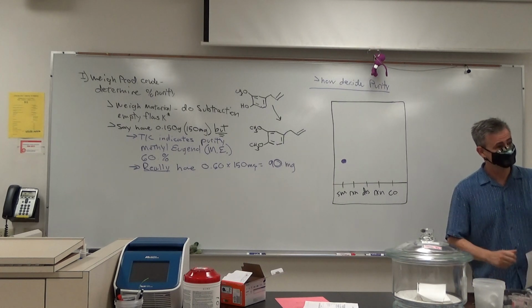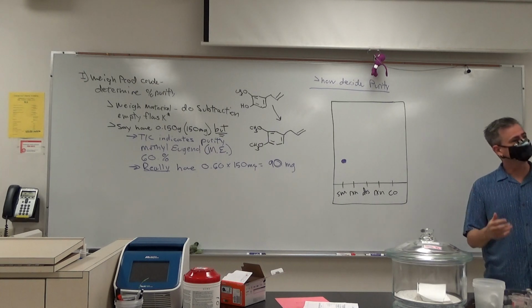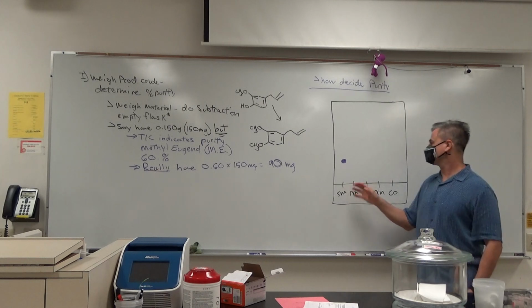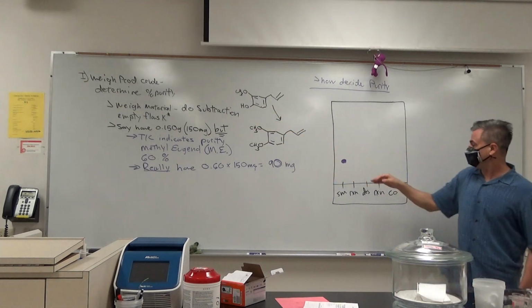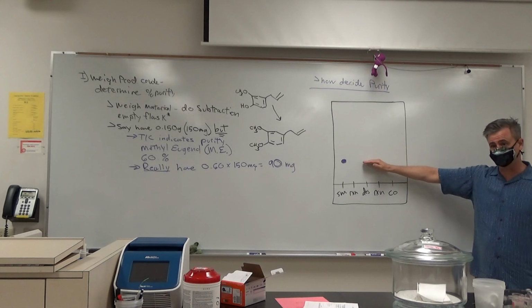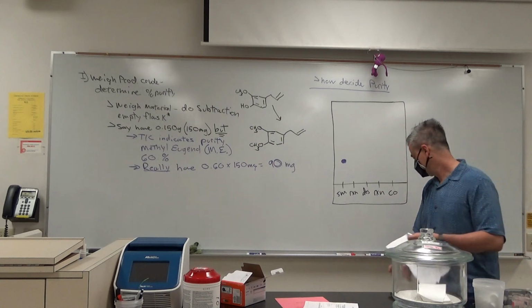It seems intuitive that more polar goes faster, but think of this as stickiness, based on polarity. The more sticky your product is, the more polar, the harder it has a time progressing up the plate. So the more polar stays lower, the less polar moves higher in general.